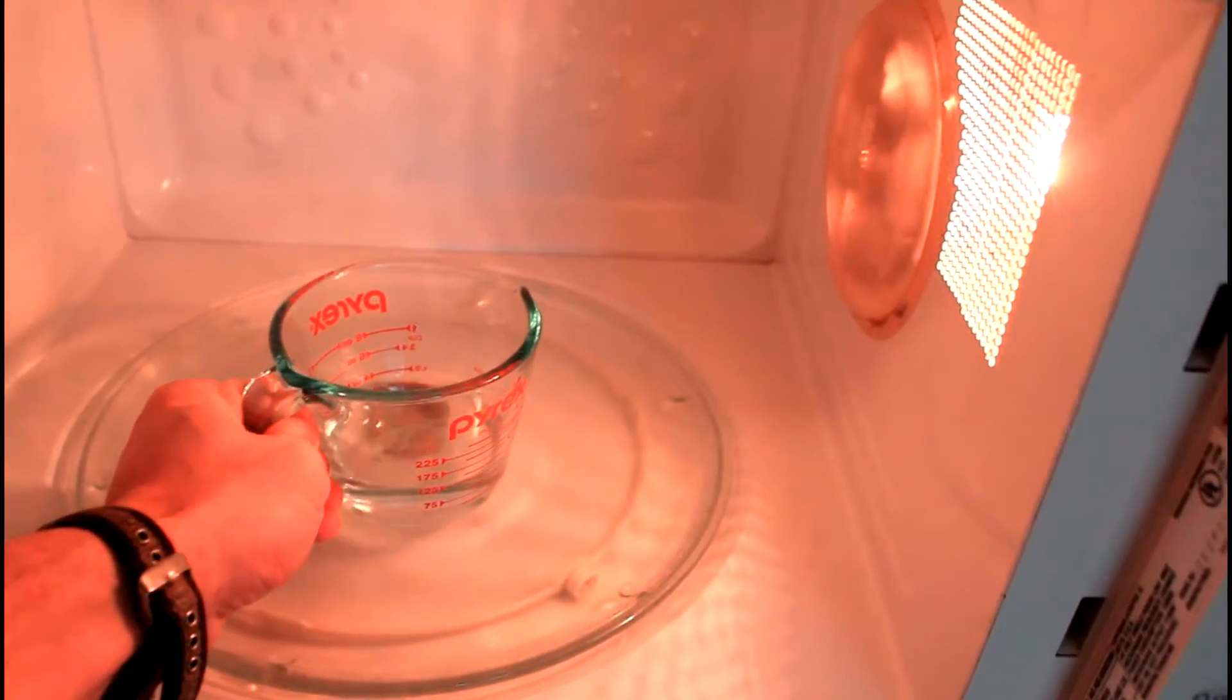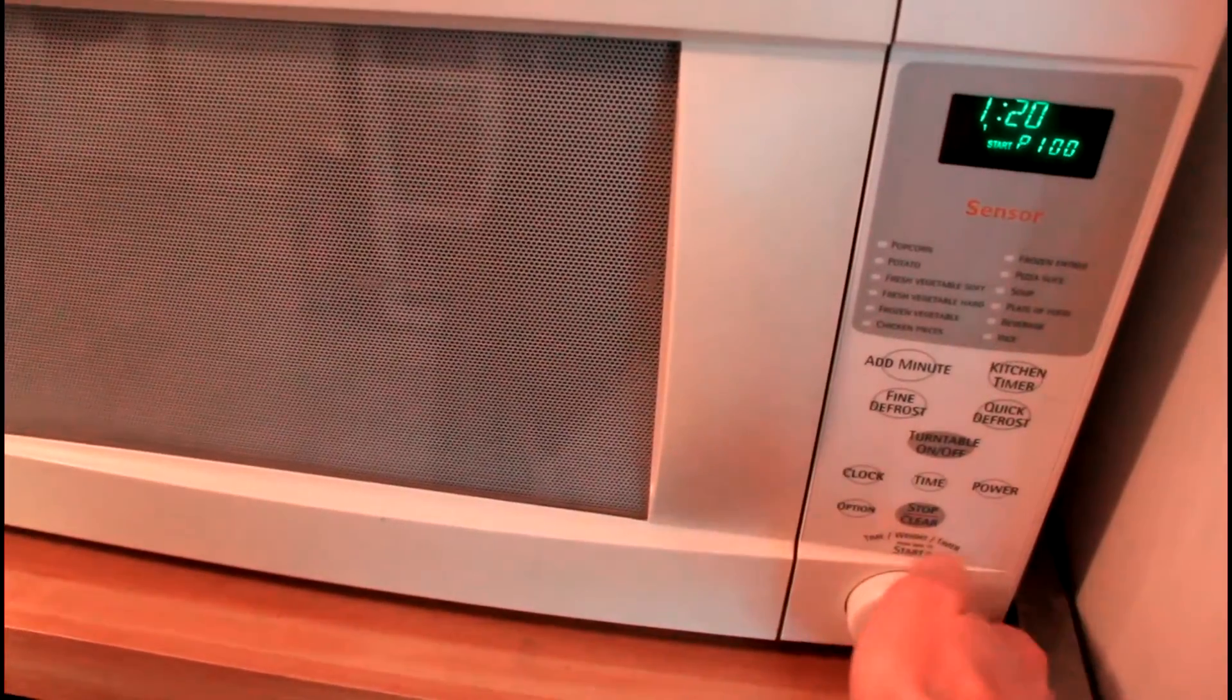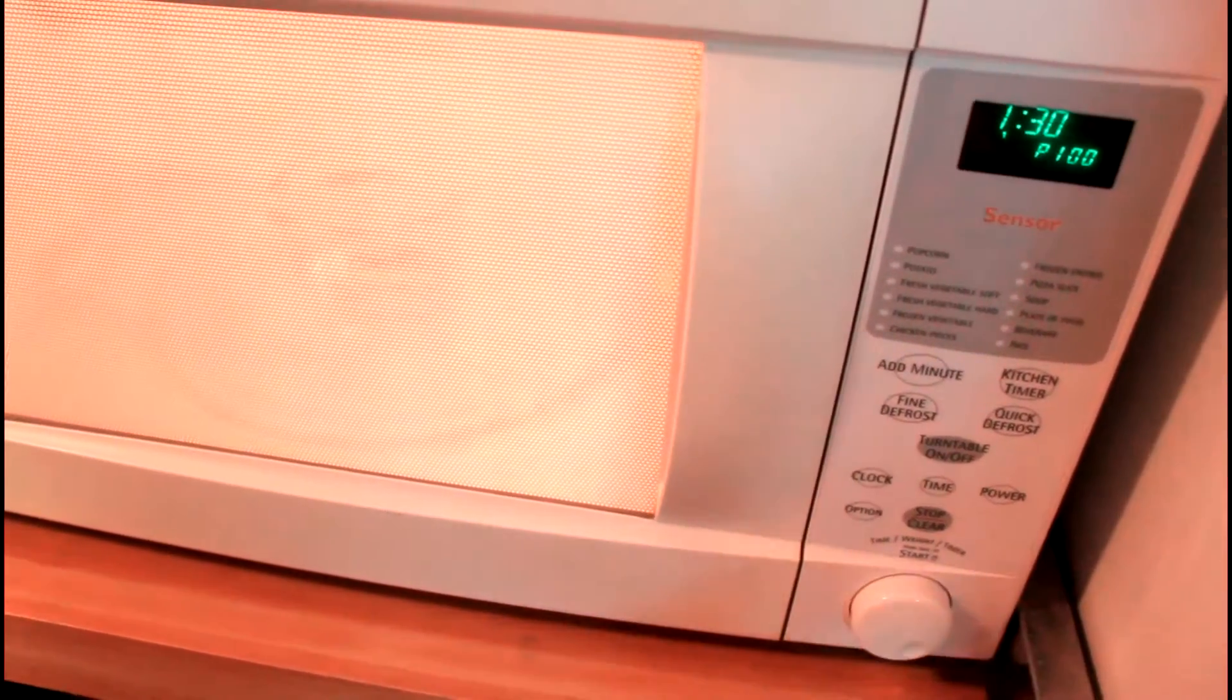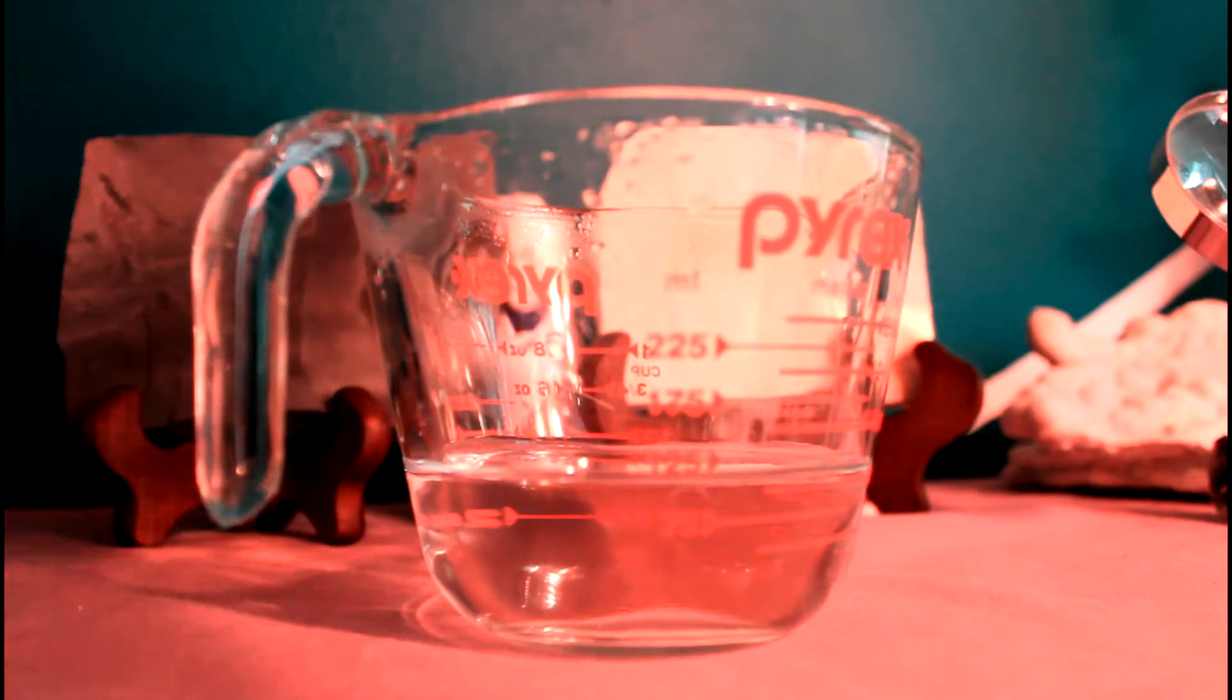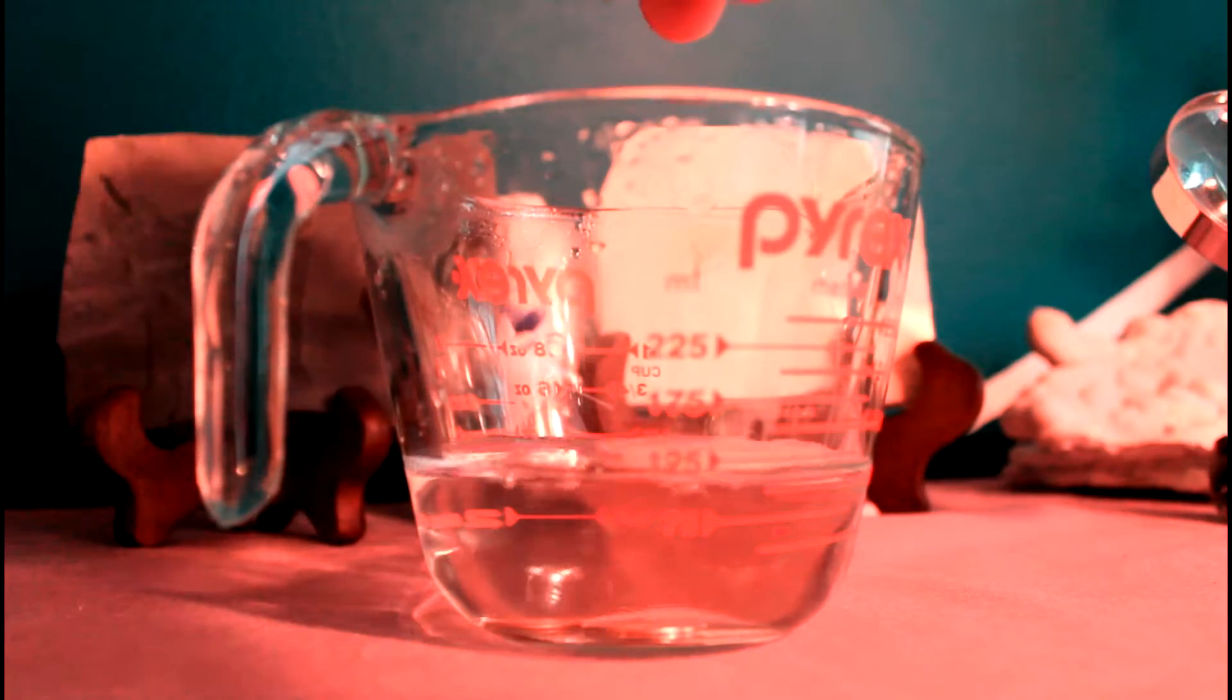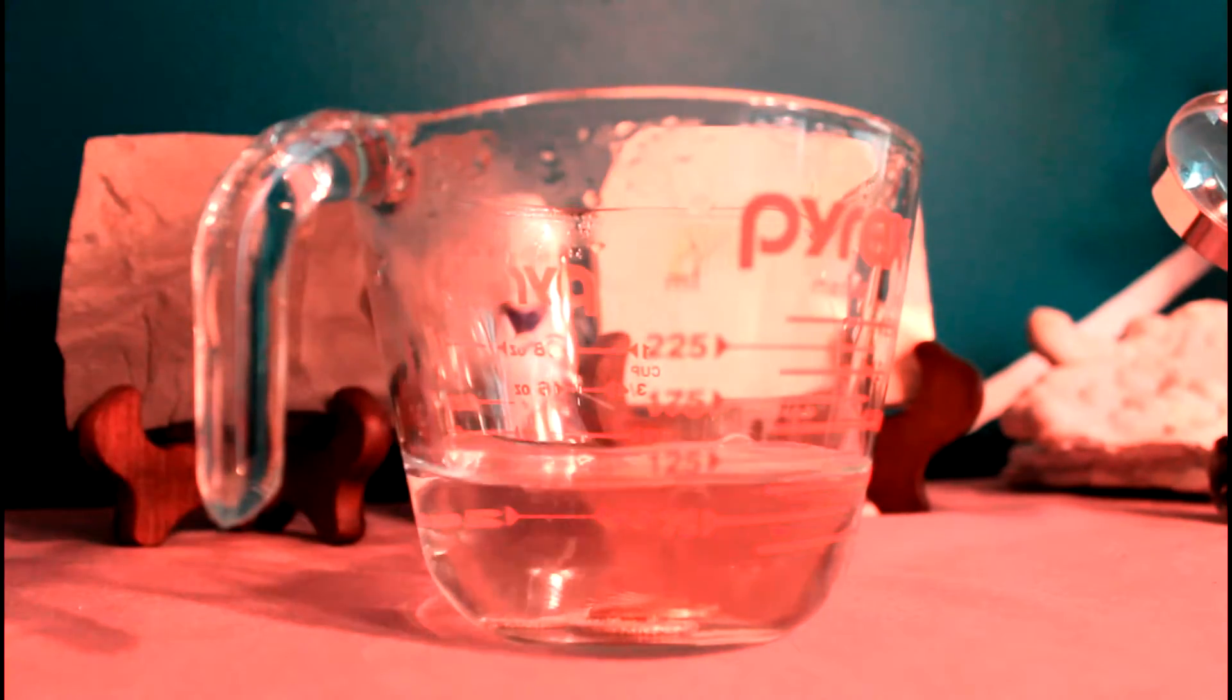Next, we're going to heat this up. Microwaves are different, and you might be using a different volume than I, but I need about a minute 30 to get it hot enough. Once you see it boiling, that's when you know it's hot enough to do the reaction. Take it out, careful it's hot, and then place anywhere from about 5 to 10 pennies in there. And then try to observe any reactions that you're going to get.